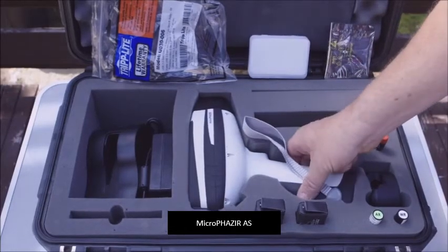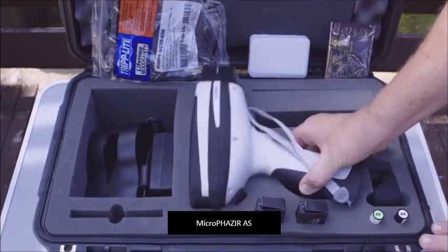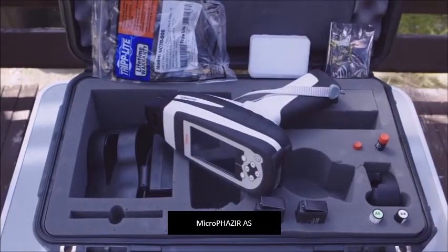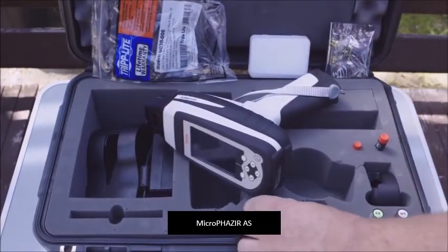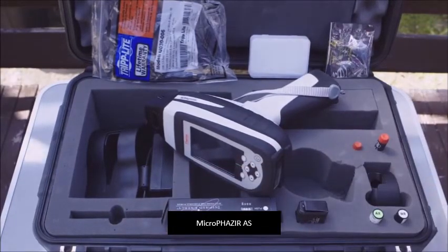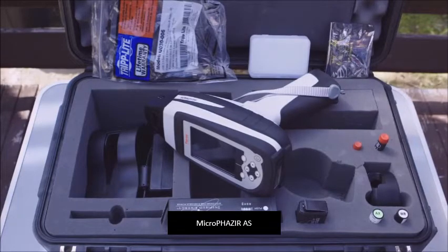Firstly and most importantly we have the actual analyzer itself — this is what will be used to test the asbestos. Secondly we have two batteries; they run for about four hours per battery, so the two together give you a full day's worth of testing.